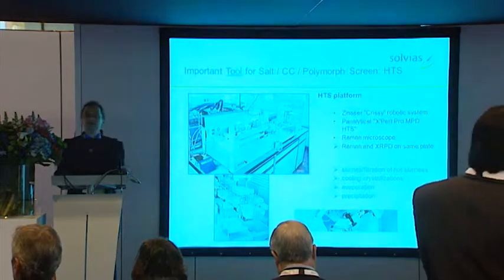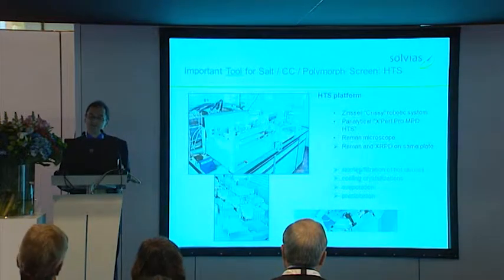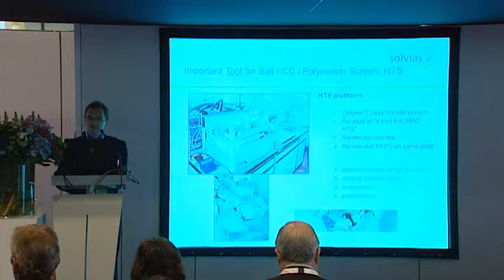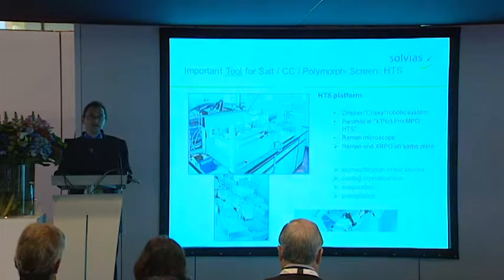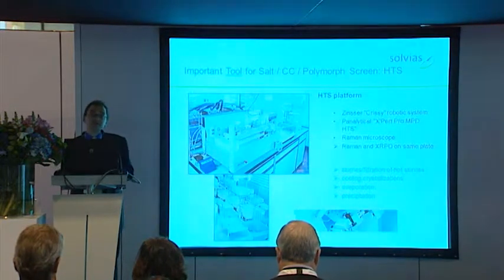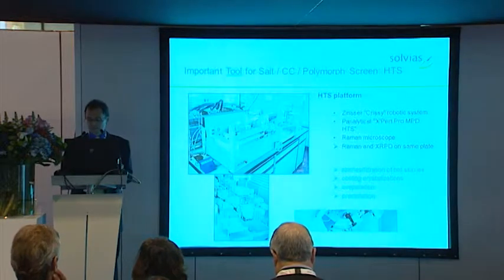And the instrument allows us to use a variety of crystallization techniques which create various supersaturations, such as slurries for a very low supersaturation. We can also filter hot slurries, which is very powerful. We can do cooling crystallizations, we can do evaporation, we can do precipitation. So we can use the whole gamut of crystallization methods in solution. And I said it's only a tool. Of course, we complement that with other crystallization techniques like crystallization from the melt, or maybe sublimation, effect of pressure, etc.